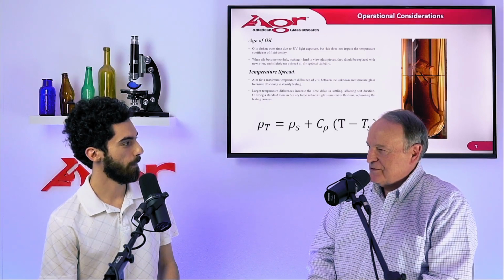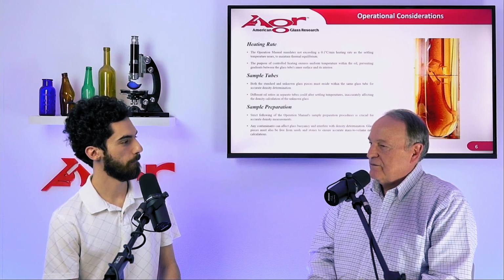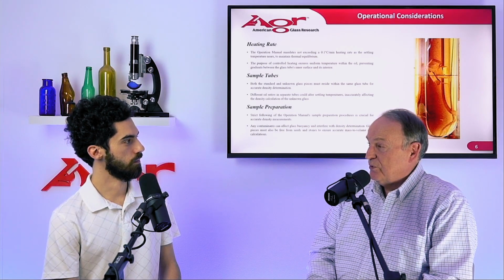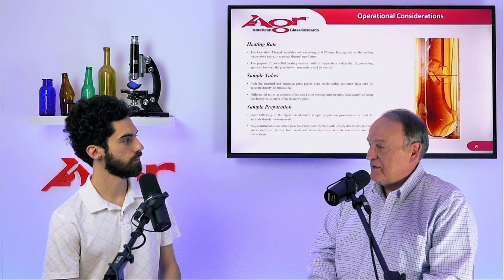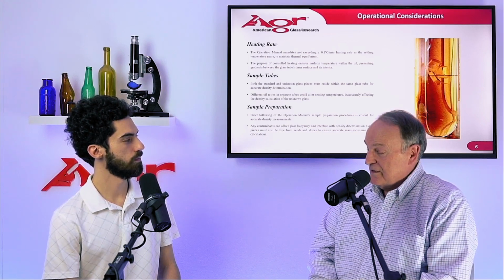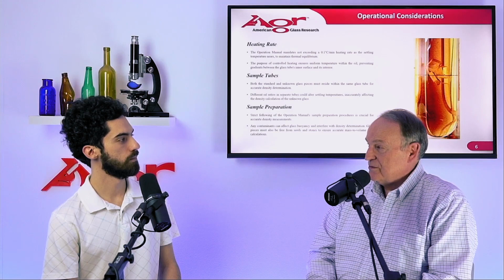Now, back to the original question, and that would be prepping those samples. You want to select pieces of glass from bottles that have a fairly consistent degree of annealing. Usually these are selected from the heaviest pull shop of the furnace, and from a glass container from the middle part of the lehr, so that the annealing is consistent from day to day. That way you don't have to re-anneal these pieces. But the big consideration is you want to make sure your sample pieces of unknown do not contain seeds or stones.